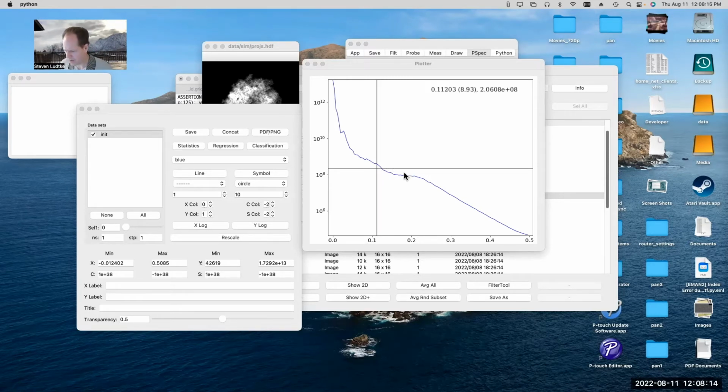It's actually kind of interesting that we see such a relatively strong beta lump in here and a somewhat weaker alpha lump, because there's actually quite a lot of helical content in GroEL. Anyway, so this is what the power spectrum of just the unmodified particles looks like.